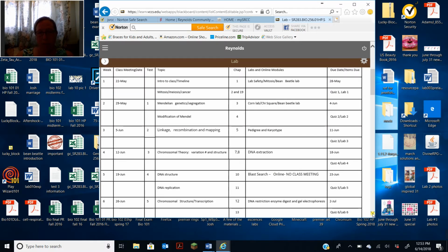And I'm going to scroll down. And you can see here that I'm just talking about the BLAST search for online. There's no class meeting this week coming up. Okay, so we're going to scroll down.